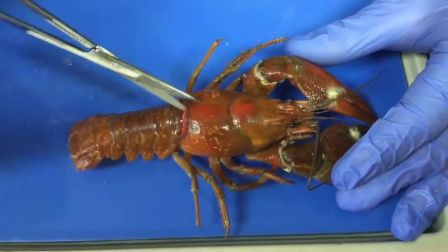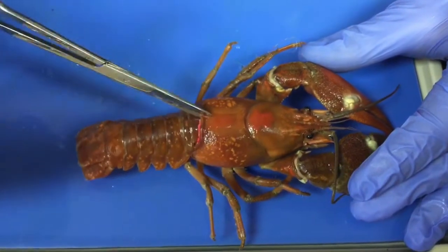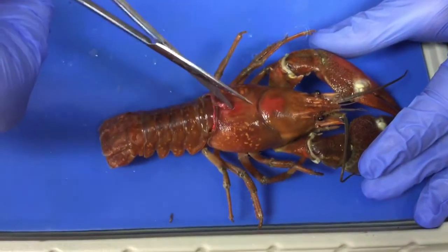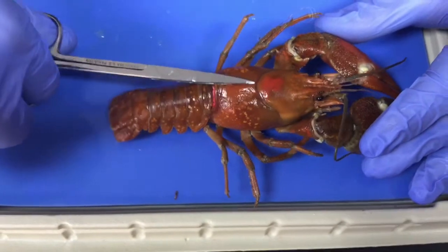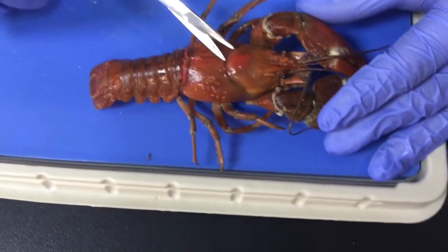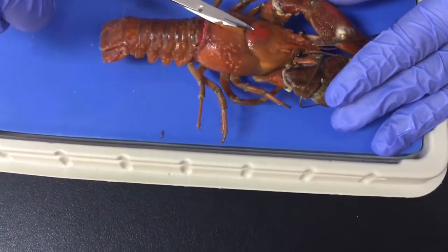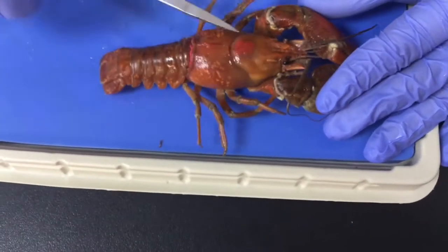All right, we're going to position our scissors at the posterior end of the carapace, and we're going to cut anteriorly and try to stay superficial so that we don't damage anything. I'm not actually cutting right now. Keep coming all the way to the rostrum, so that's right between the eyes. Try to stay very superficial.